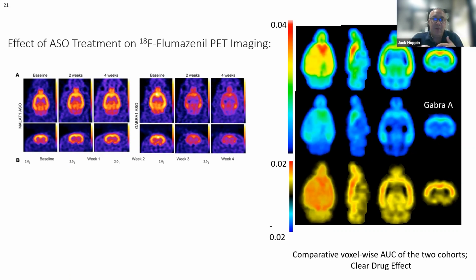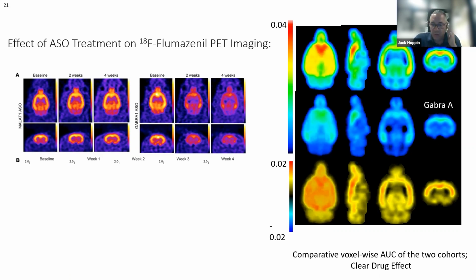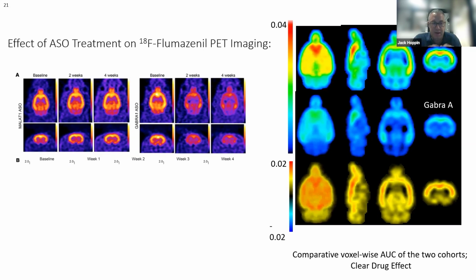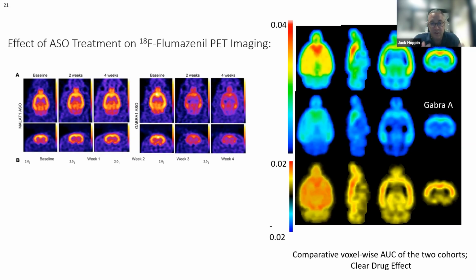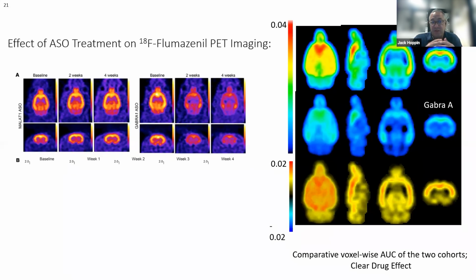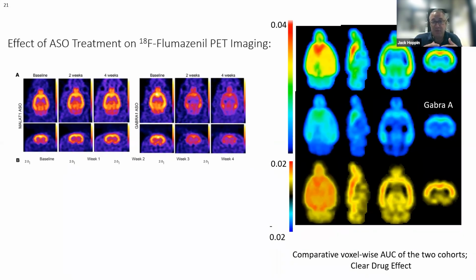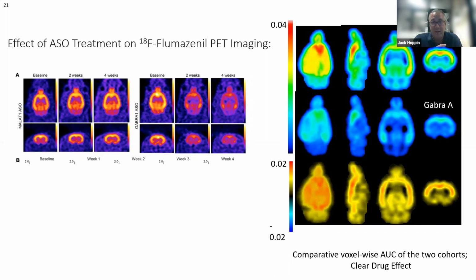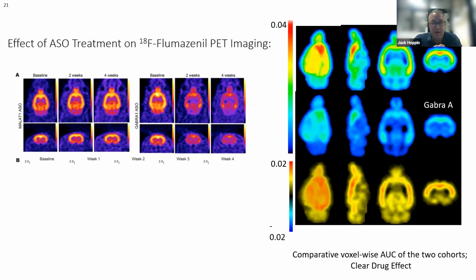Having run a lot of these studies, I think the value proposition here is we often have to run many, many studies to paint a picture of the pharmacokinetics and pharmacodynamics of a drug. This is a single study. I wouldn't say it's not a complicated study. I wouldn't say it was an inexpensive study. But if you think about how many things it answered, price per data, this is a powerful technology deployed to great effect, which is why I have a bias towards that technology.